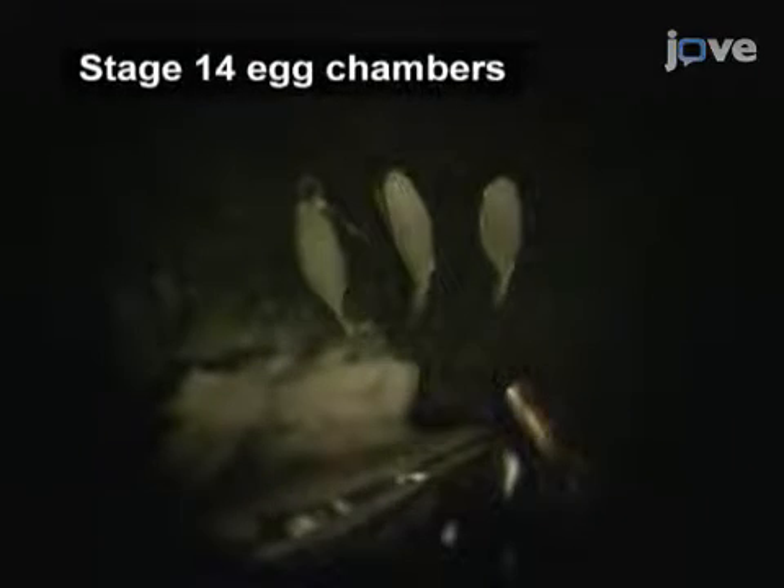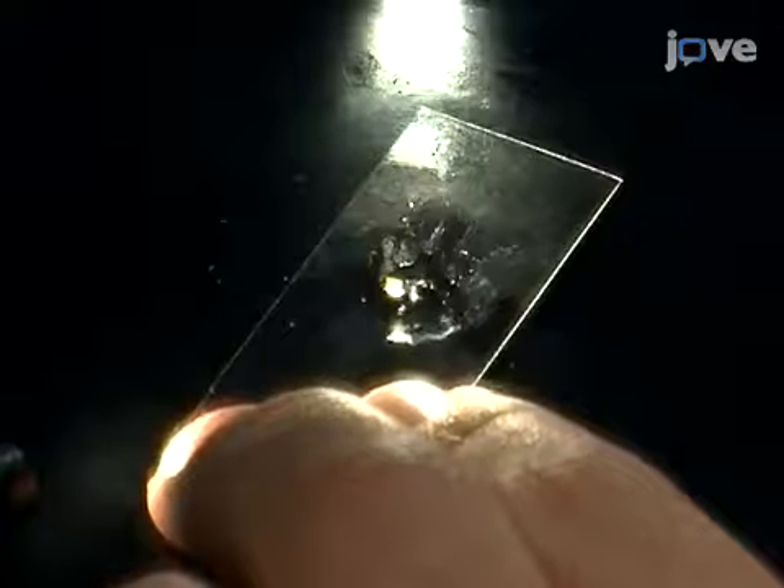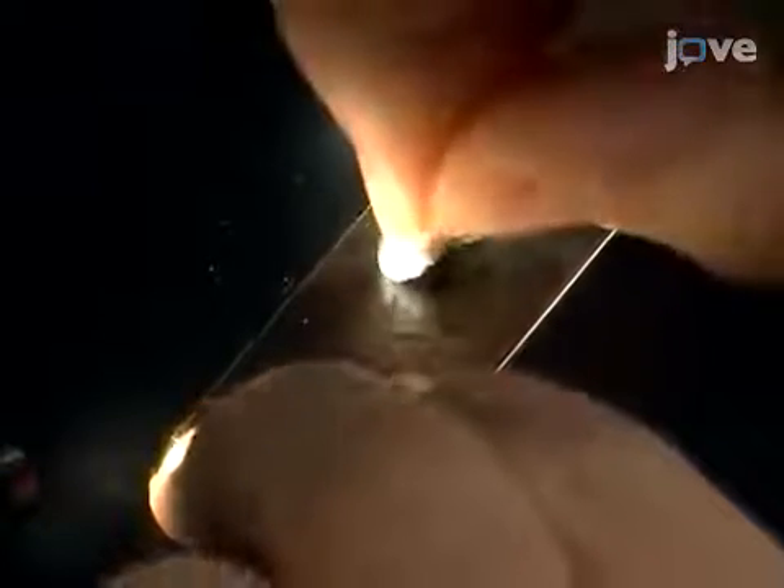Next, remove the rest of the ovarian tissue by dragging it away from the aligned eggs. Then, remove excess oil by dabbing it with the corner of a medical wipe.